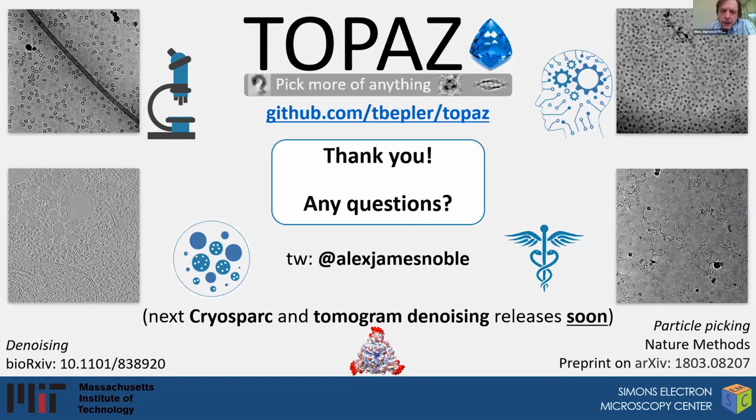Okay, thank you. So there are a couple of questions about how you mentioned Topaz integration into CryoSPARC. What about getting the particles into RELION? To get out of CryoSPARC to RELION, there's a script, I think it's from the CCP-EM people, or maybe a different set of scripts, but it's called csparc2star, something like that. If you do a Google search for CryoSPARC to RELION conversion, you'll find that script and a bunch of people explaining how to use it.